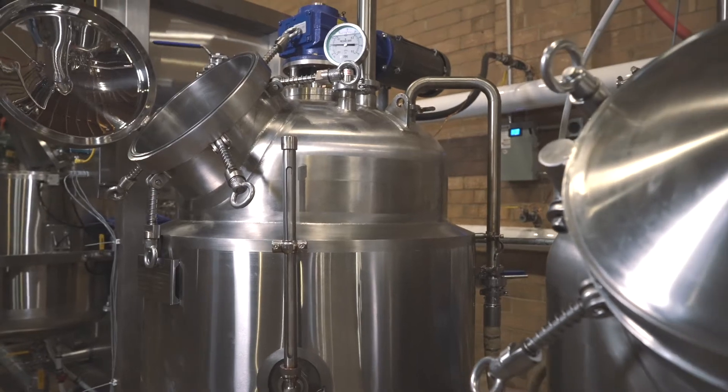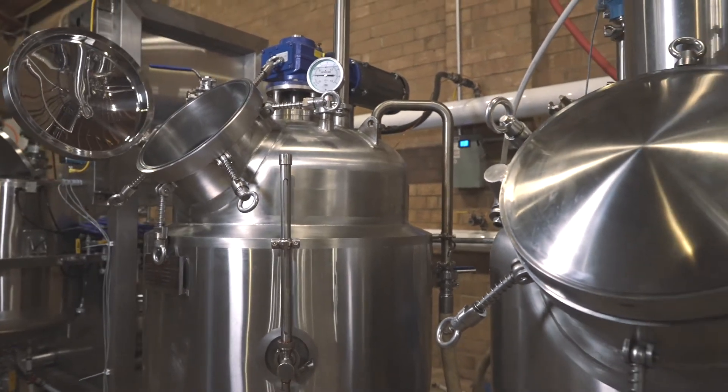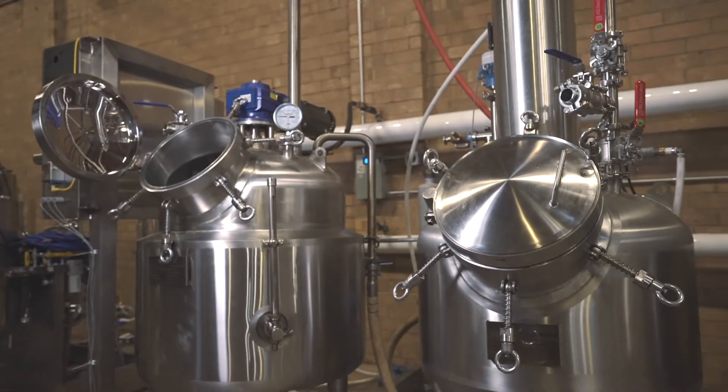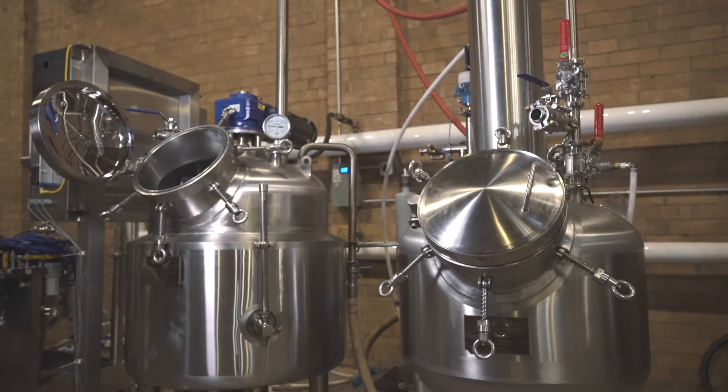The Deutsche Roto EVAP is designed for bulk solvent recovery via single-stage distillation. This process is based on the evaporation and condensation of solvents in an agitated, continuously stirred tank reactor.